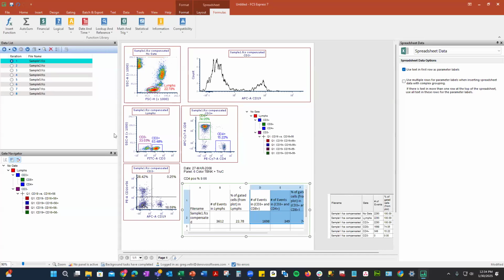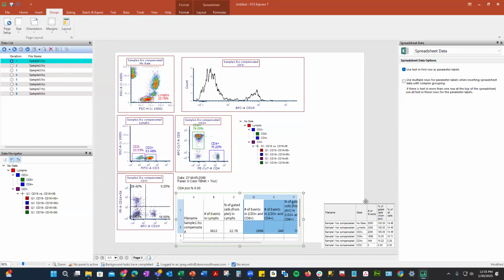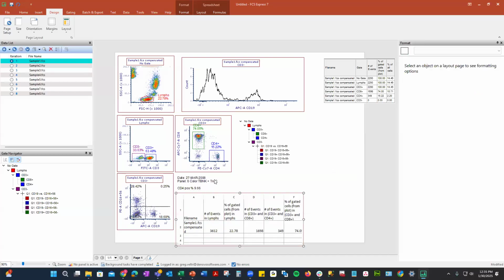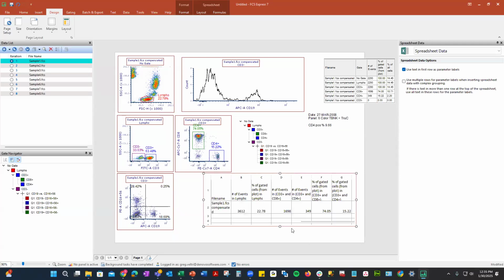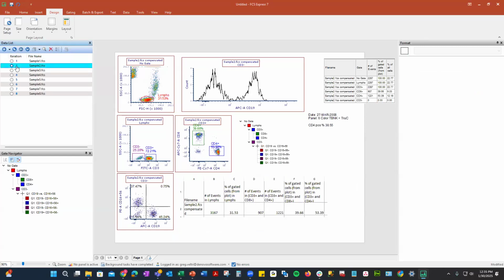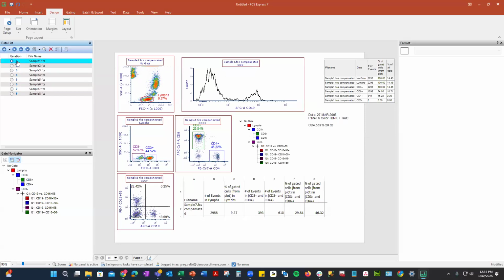I'm kind of losing my real estate here, so I can move things around a little bit. So let's bring this in a little. So you can see that all of these windows are modular and I'm able to change things. And then I also mentioned in the design, if I wanted to go landscape, I can go landscape. So let's do that. Put that there. We can even take this and put that there too. So we can see everything. Okay. So now I have some statistical information. If I go to, you'll see up here my iterations, if I select the next file, all of that information is changing as I go through it. Okay. And we'll go back to number 1.